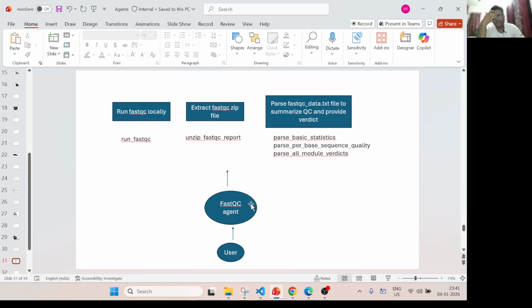Okay. So again, if I just summarize this use case, in the traditional way, we used to do any workflow like 1, 2, 3, 4. So it is deterministic. We can plan our agent to work that way, and also we can give full autonomy to the agent, so let it do whatever it wants. But you see the beauty, here you can use the brain of the LLM to think, and based on the QC parameters it can decide whether it's good or bad.